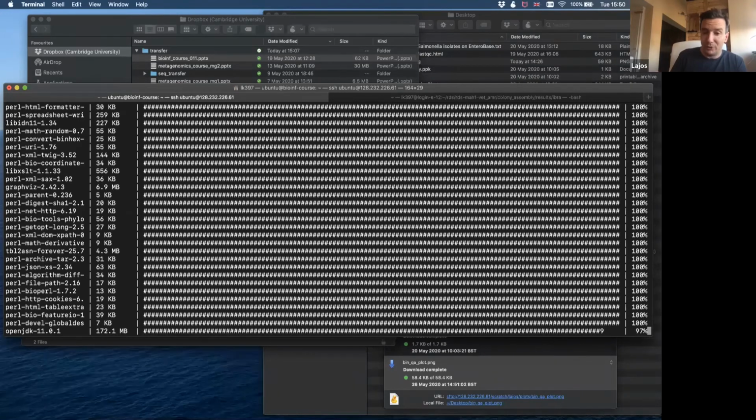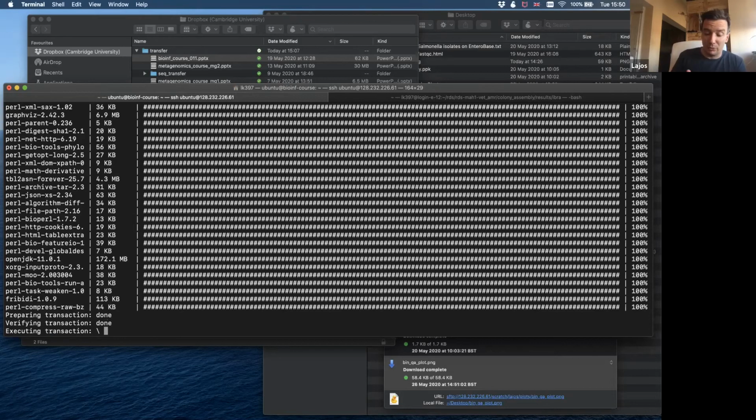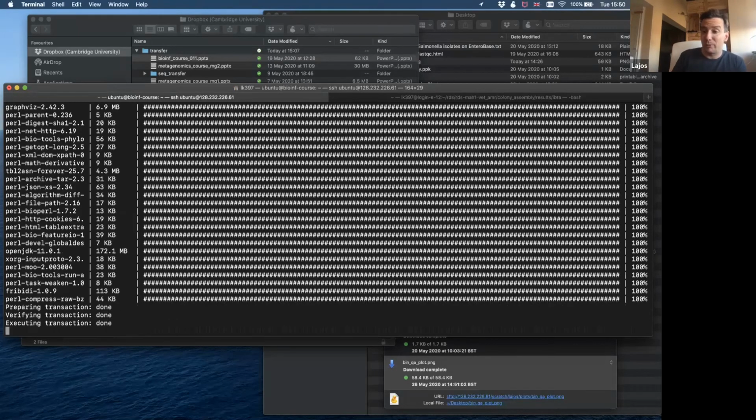And maybe that's your whole aim in your project, that you have a lot of isolates and you want to check virulence genes in them, you want to check MLST, but you want to have the genes for the MLST typing, or you want to see the antimicrobial resistance profiles, what kind of AMR genes are encoded, or you want to check if a specific metabolic pathway is present, and you have all those gene names in your list you have to find in your genome.